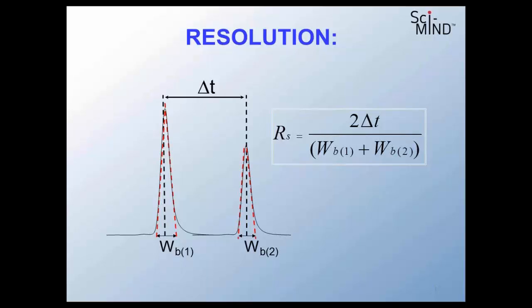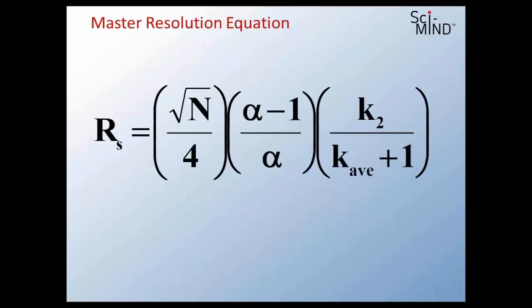That's one of those things that probably moves a little bit further away from the ease of use portion of the triangle, even though, of course, we can get very high resolution and speed out of it, but it's also more expensive and more difficult to use than traditional HPLC. So that's where I might place UHPLC on the triangle, a little bit more toward the speed and resolution corner, and a little bit further away from the capacity and ease of use corner. So we think about our goals with that. But yes, UHPLC is a very interesting technique, certainly one worth exploring for the folks that do a lot of HPLC.